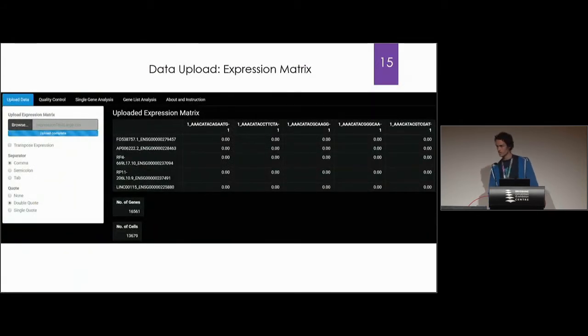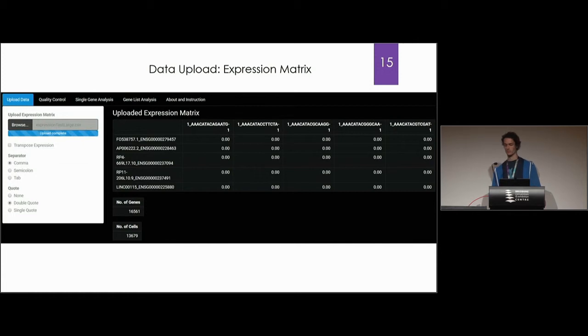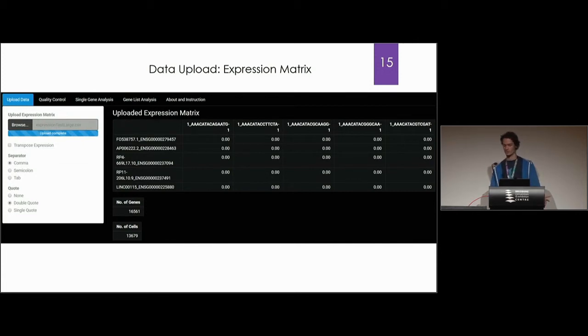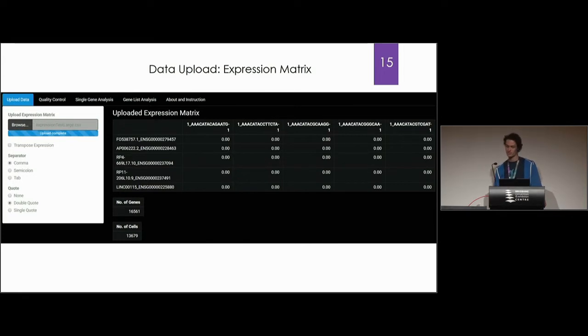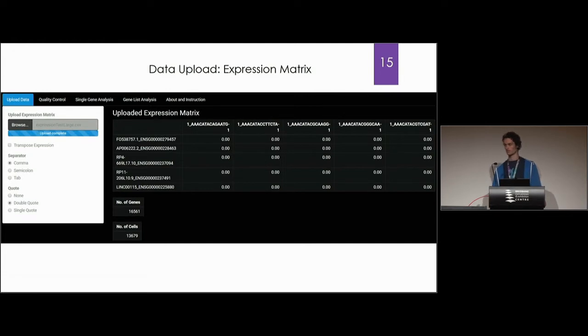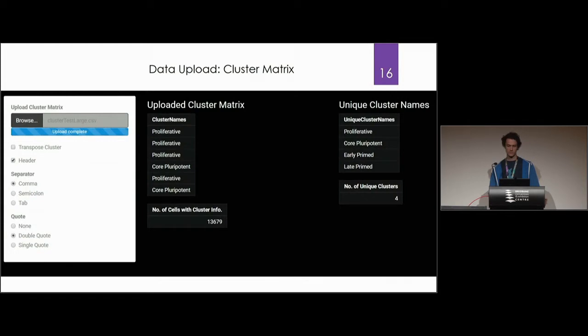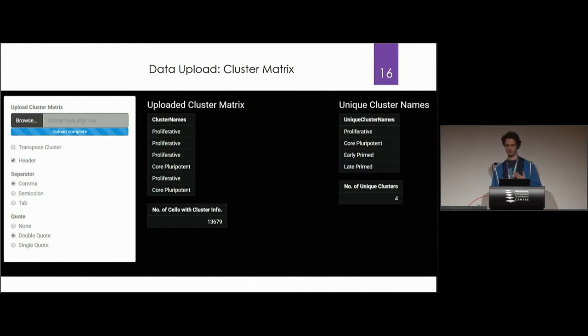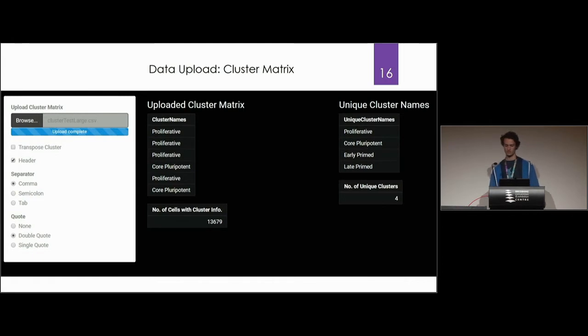Uploading the expression matrix is what you would have seen before. You can upload it as an Excel document, tab separated, anything kind of like that. The app can currently take up to 10 gigabytes worth of data and you can also run it locally if you want to scale it up even further. You also have to upload a cluster matrix of your predetermined cell types and it shows that you've got the right amount of cells to get a nice correlation between the two.